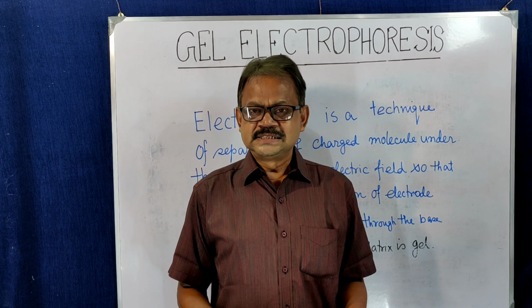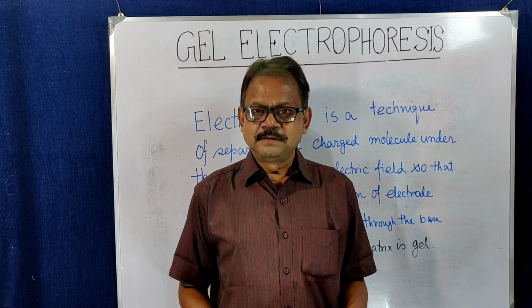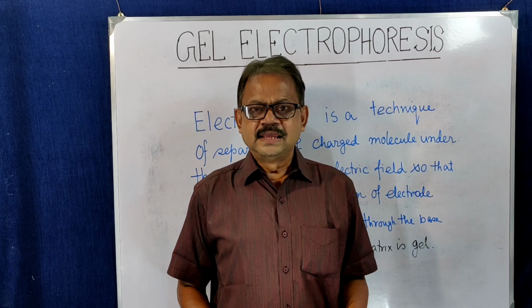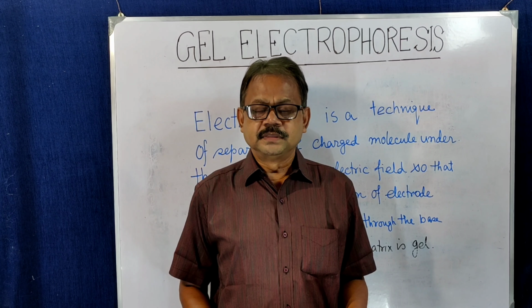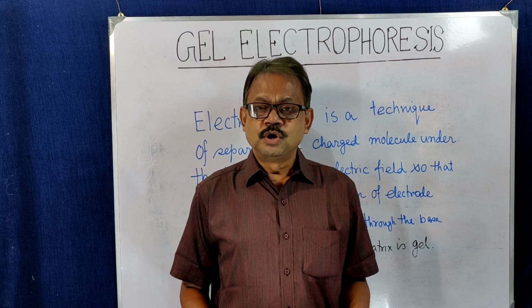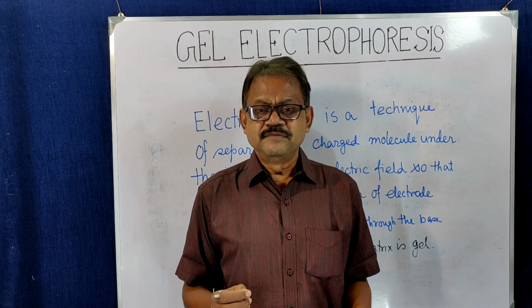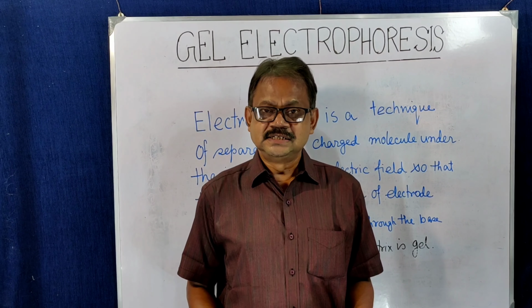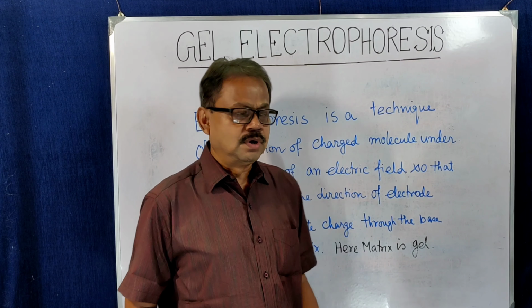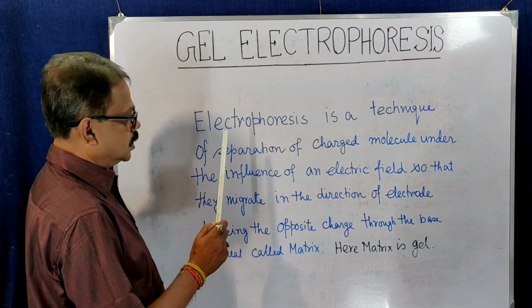In the third step of recombinant DNA technology, with the help of an enzyme, that is restriction endonuclease, the DNA is cut into different fragments. And there are fragments of different size. Some are small, some are large. But we want very small DNA fragments having the desired genes. For the separation of the smaller fragments from the larger ones, there is a process called gel electrophoresis.